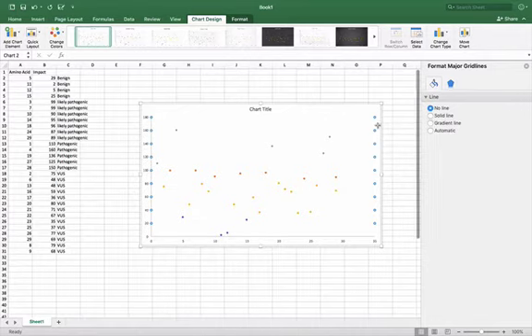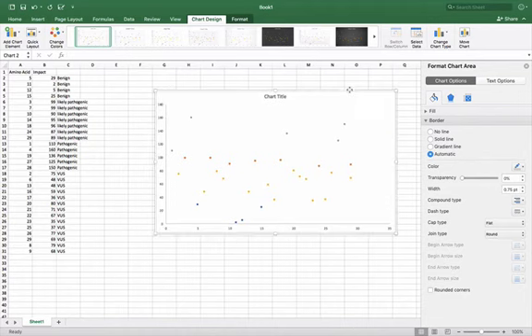One thing I forgot to mention is you also have your patient. So if you have already selected a variant of unknown significance, and let's just say that you wanted it to be completely separate, then you set it up as a separate category. And one thing that I found helpful if I'm trying to do that is I copy the row that contains my variant and I move it down to the bottom of the list. And then I just set up an extra legend category and pick that one.